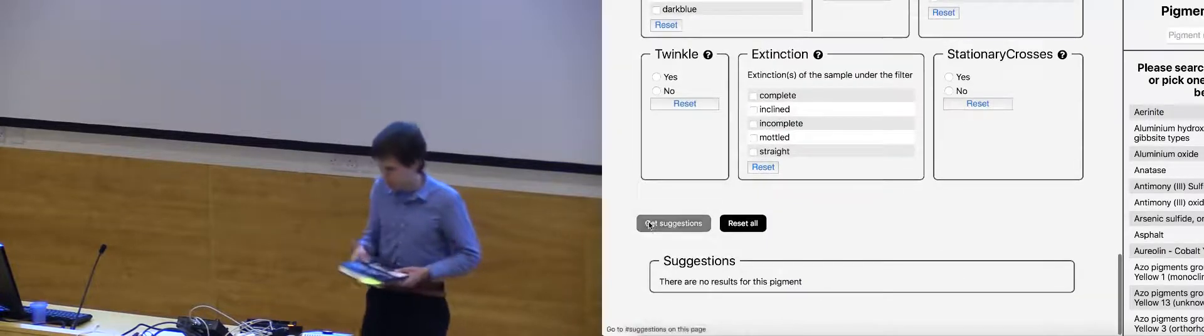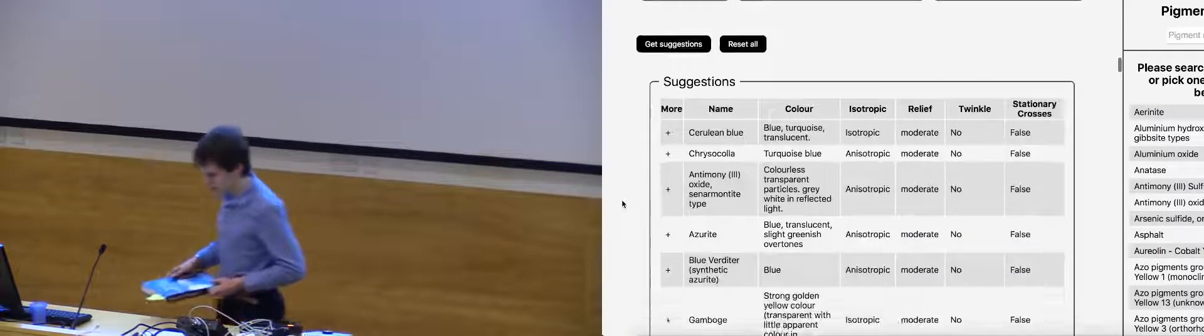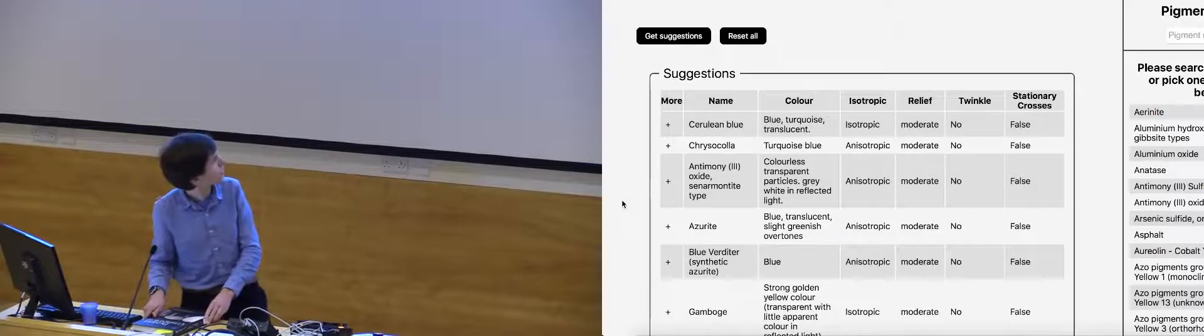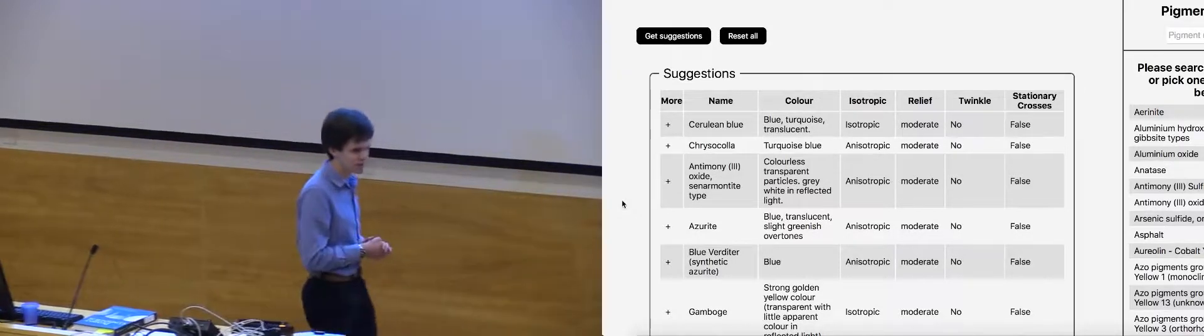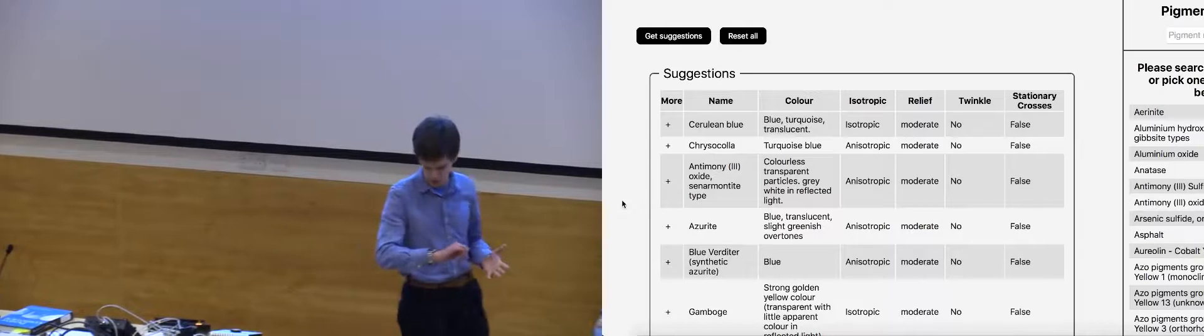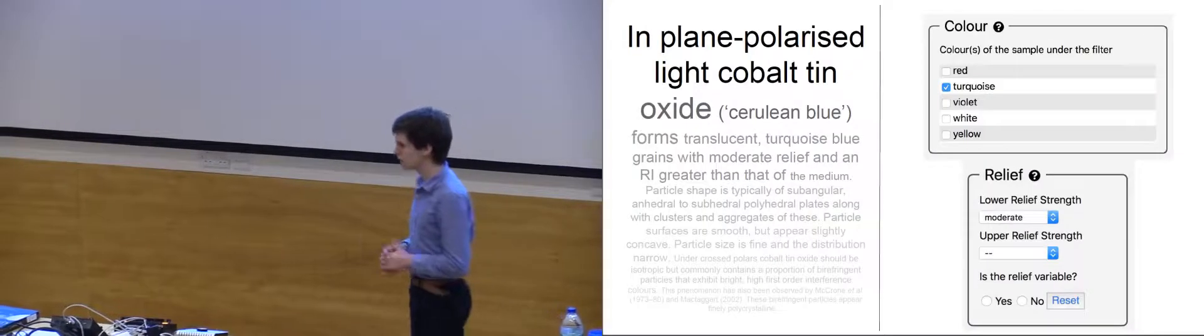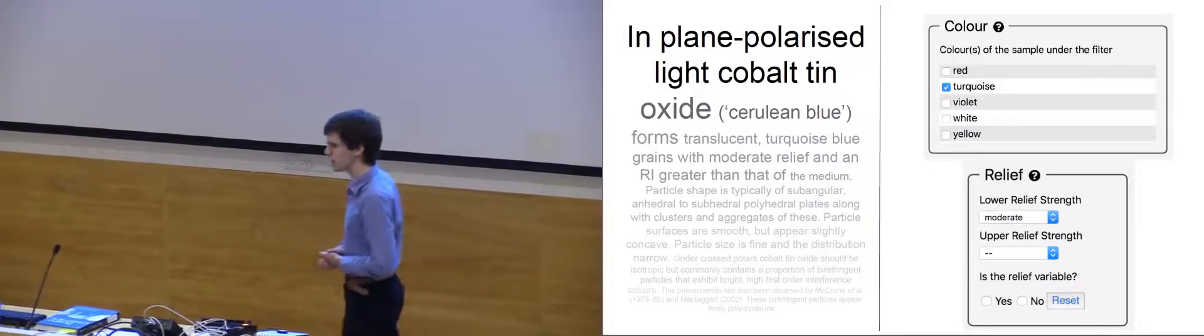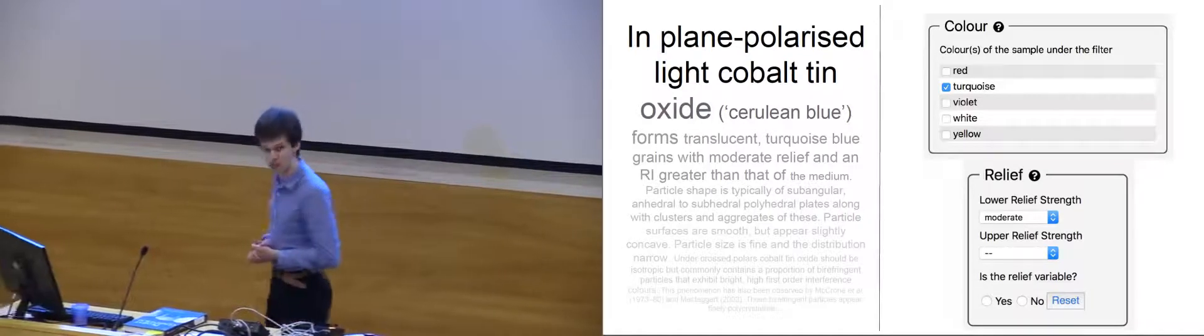Now, even with only these three characteristics entered, we can see that cerulean blue appears at the top of our suggestions list. And hopefully this gives you a kind of feel as to the kind of difference that our programme can make in the lives of someone practising PLM.